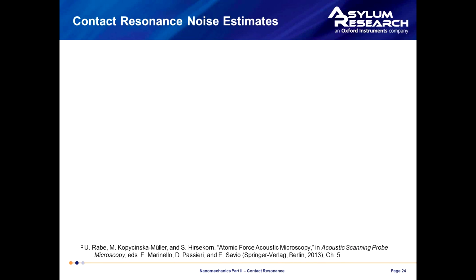Okay, we've looked at a few different methods, DART in particular, for measuring the resonant frequency in contact resonance. It'd be nice now to step back a little bit and look at the noise estimations for this. So what I mean by noise estimates is that if you measure a resonant frequency, and that's our step 1, measuring observables, as I discussed before, if there's an uncertainty in that measured contact resonance, how does that translate into either a stiffness or a modulus uncertainty?